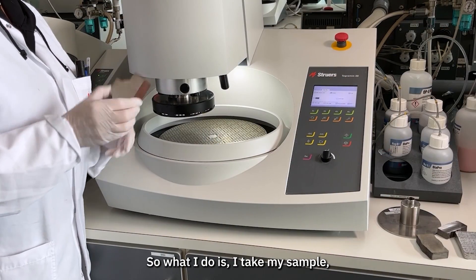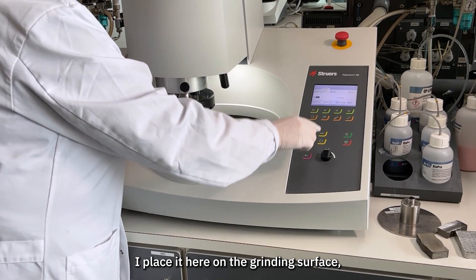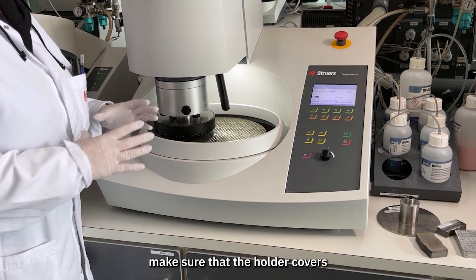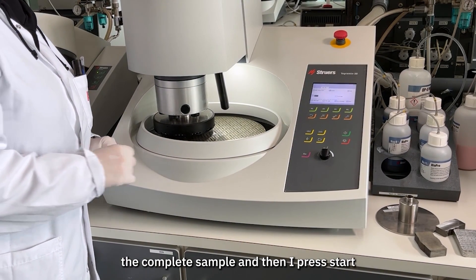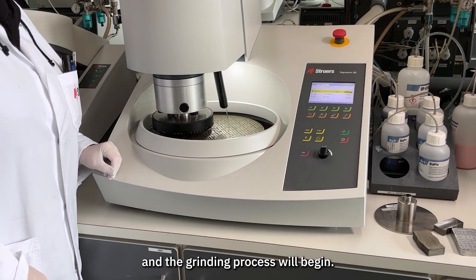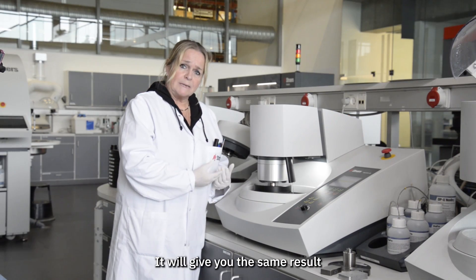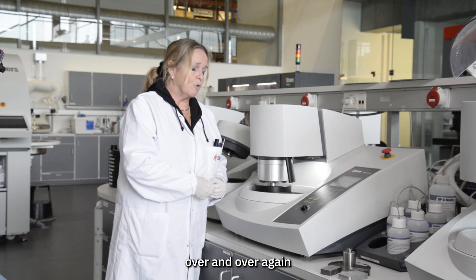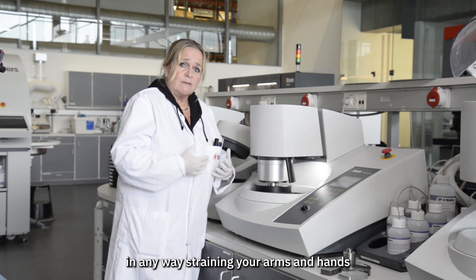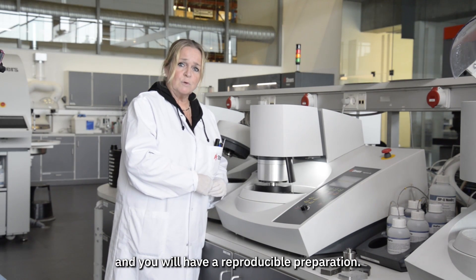I take my sample, place it here on the grinding surface, lower the holder, make sure that the holder covers the complete sample, and then press start — and the grinding process begins. It will give you the same result over and over again, without straining your arms and hands, giving you a reproducible preparation.